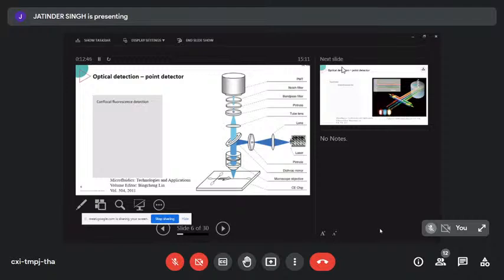So what we've got here is a laser or LED as a light source, and the laser light gets focused by a lens. Light always spreads out everywhere, like my laser pointer. It's really small when I stand close by, but if I point at the other wall, the dot gets bigger and bigger, because the light is never nice and small in a circle. So we've got a lens here to focus it to a point. Then we've got a pinhole that pretty much makes the circle nice and small again.